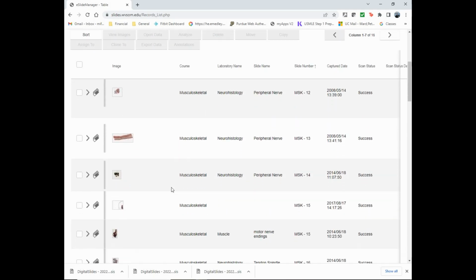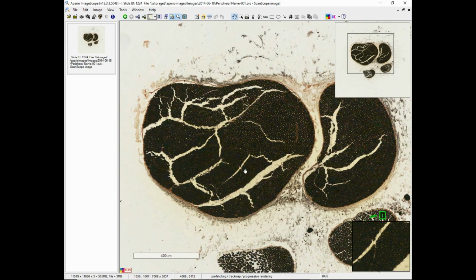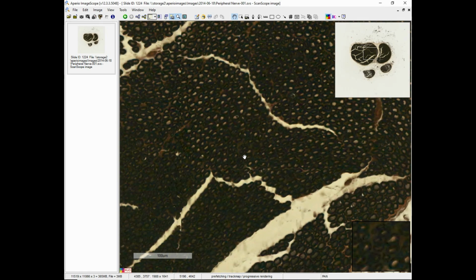All right, we're going to take one more look at a cross-section of a peripheral nerve before we move on to a slightly different view. And in this case, we're looking at it in a really unique way. This is an osmium tetroxide stain. And as we mentioned before, some stains are good at showing some things, but not others. This stain is incredibly good at showing us where the myelin sheaths are.